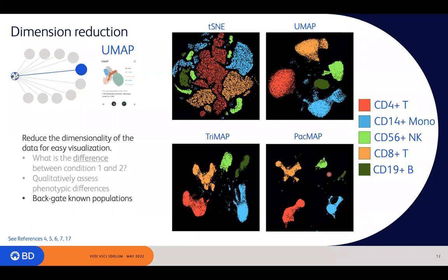Okay, in contrast, cells that are more highly related to one another are a bit closer in space here. So for example, the CD19s and your monocytic cells tend to juxtapose a little bit closer together in space than they do, say, with the T cell fractions. Right, same thing over here and same thing over here.